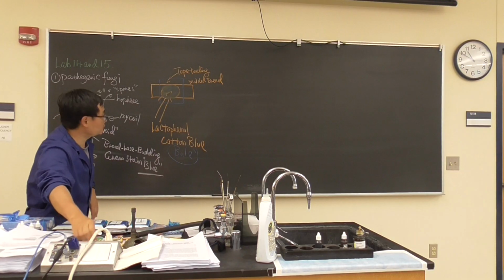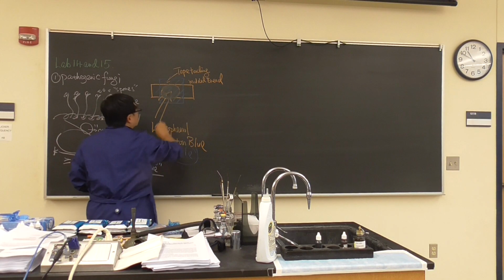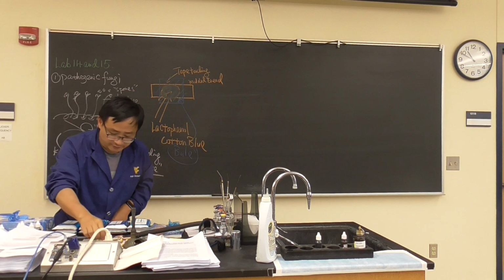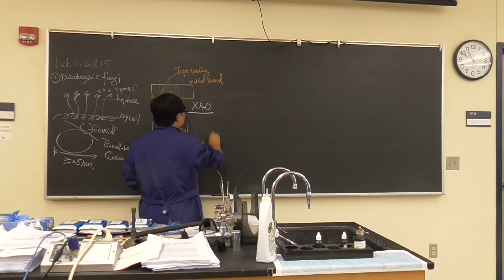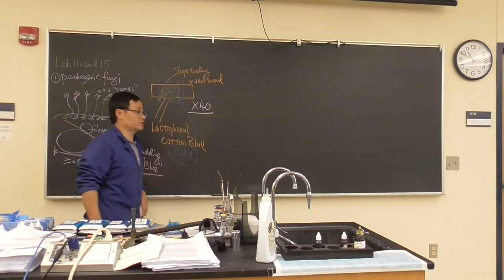So at the end, ideally this whole area will be lactophenol cotton blue, looking like a blue color. And then underneath the microscope, this is the only time we're gonna use 40x. We want to do the observation.